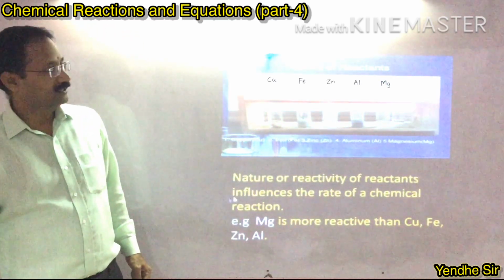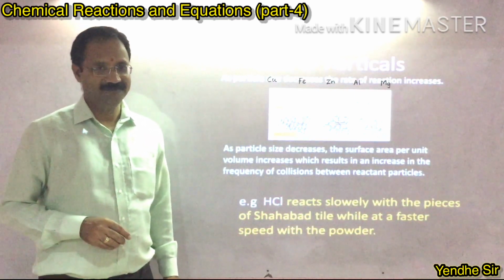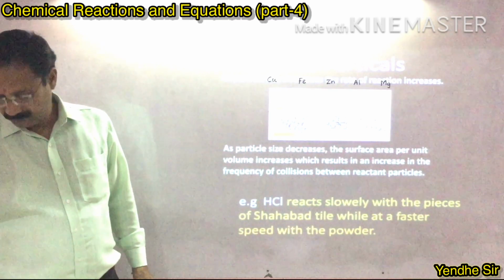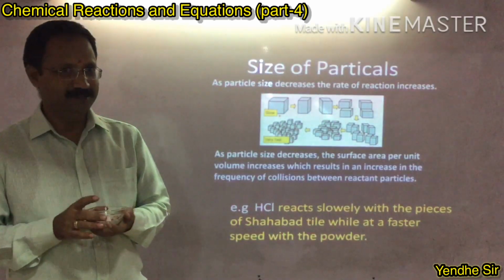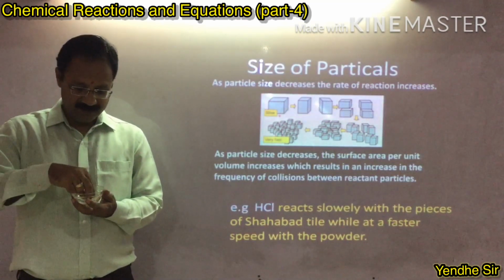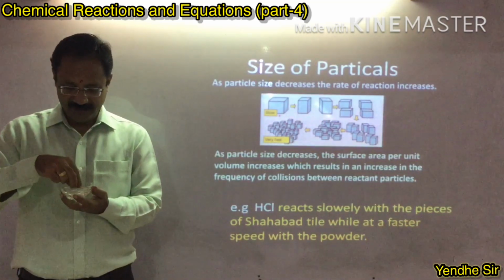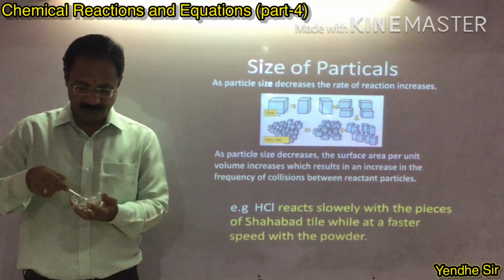Now let's see the next point, size of the particle. Hello students, let's see one experiment here. See, this is one bigger particle and these are the smaller particles. Here I am going to show you.